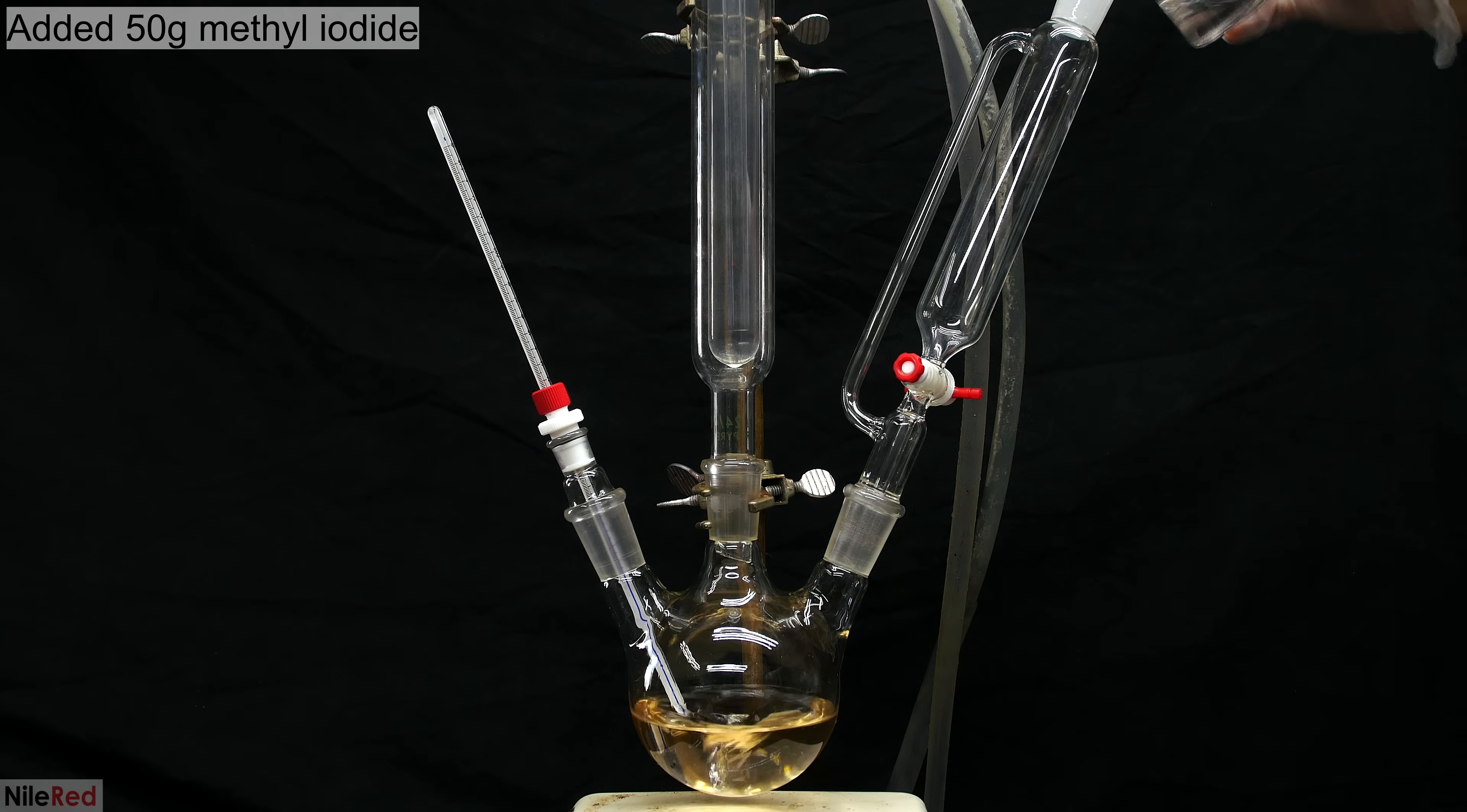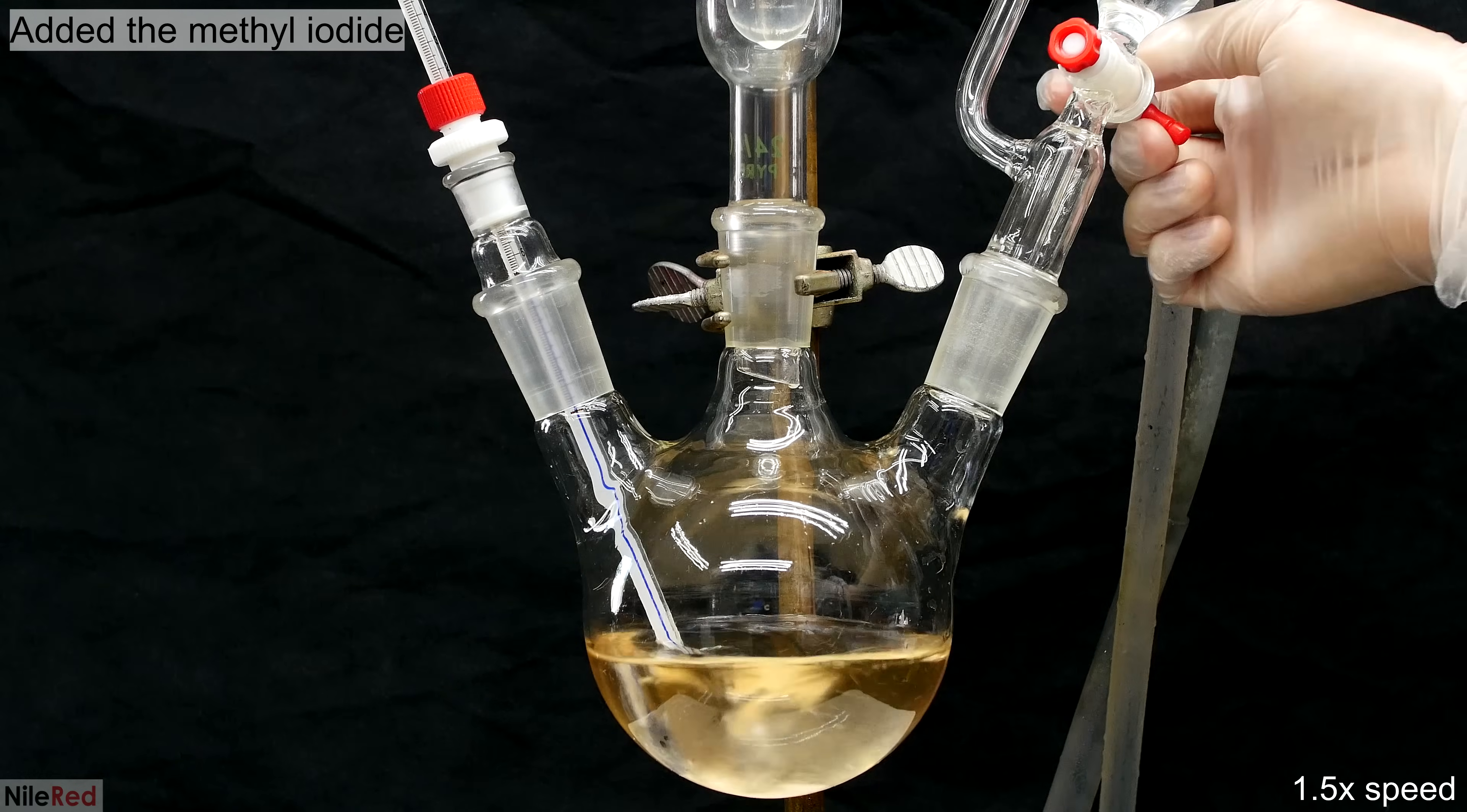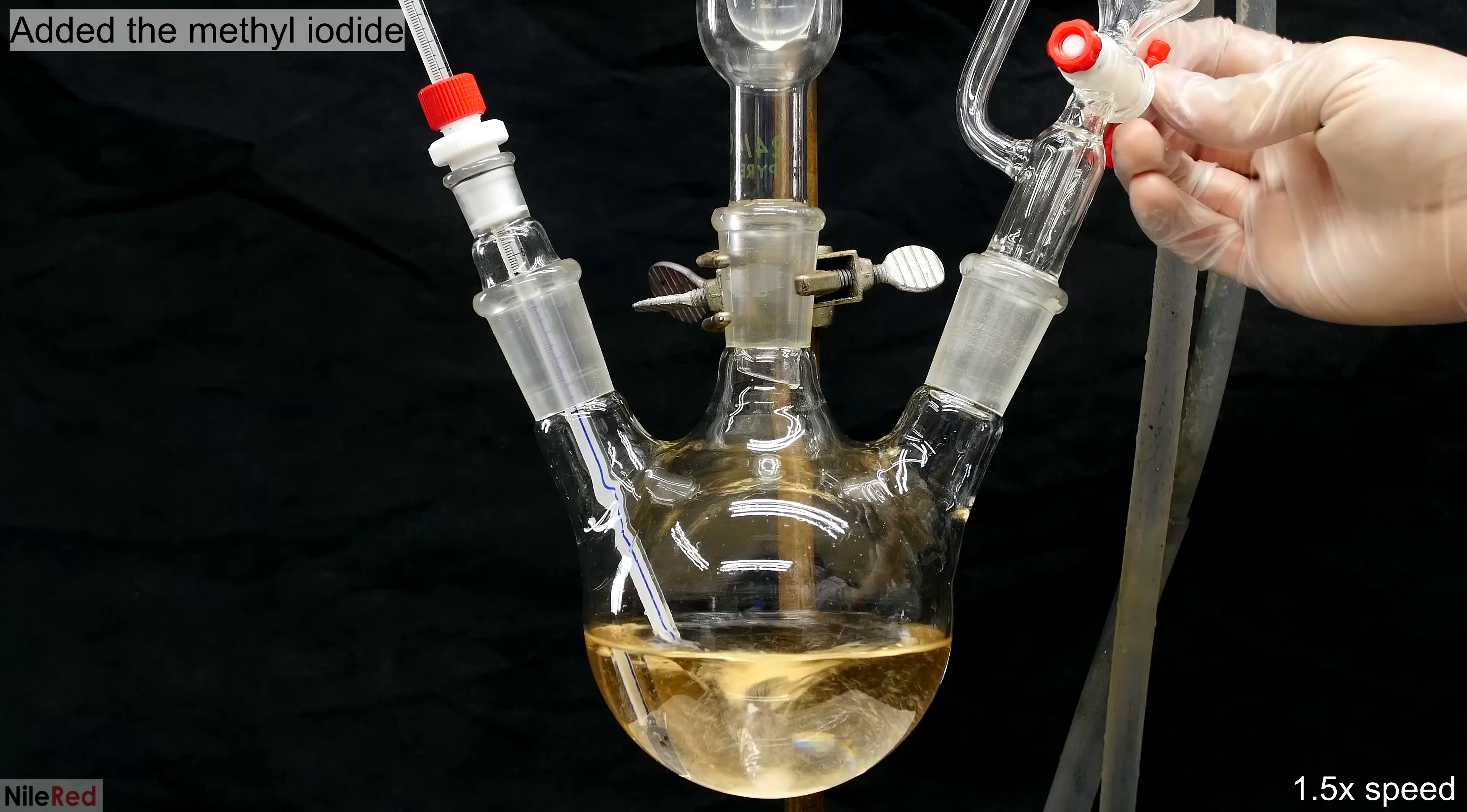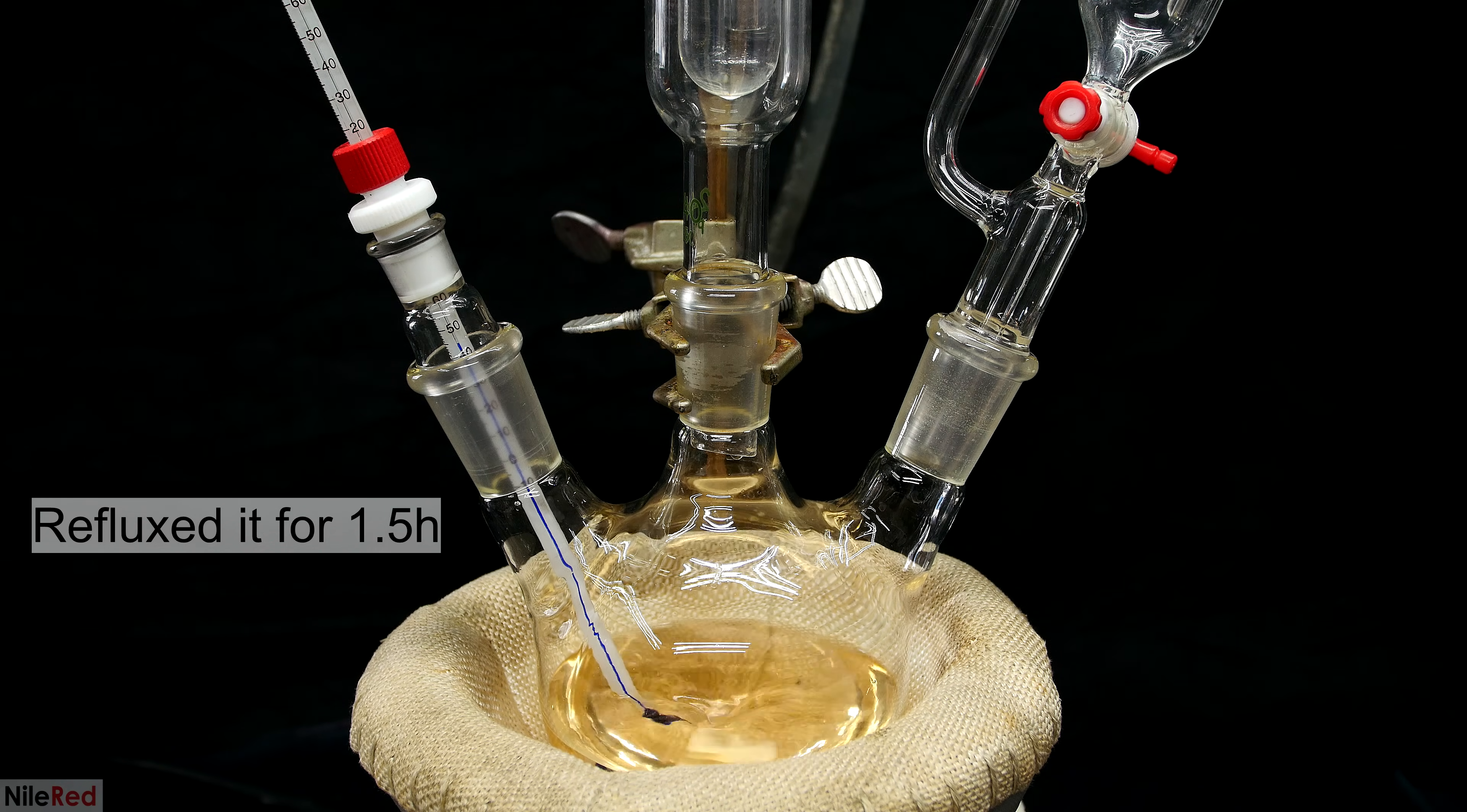The stopper is removed and it's replaced by an addition funnel, and to the addition funnel, I add 50 grams of methyl iodide. The addition funnel is opened and I start to add the methyl iodide. In the video made by Chemplayer, the temperature went up to around 70°C, but for me, I didn't really have any huge temperature increase. I'm honestly not exactly sure why Chemplayer's temperature went up and mine didn't, but if you guys have any ideas, I would love to hear them in the comments. After all of the methyl iodide had been added, I place a heating mantle below the flask and I bring things to a boil.